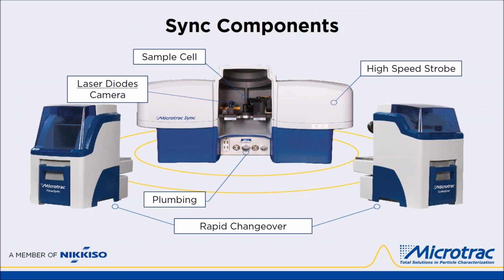Here are photos of the Sync liquid dispersion module on the left, the optical bench and electronics, and the dry powder dispersion module on the right. The dispersion modules, each with its own sample cell and mounted on 4-ball bearings, can be interchanged within 10 seconds, with all tubing and electrical connections mating automatically.